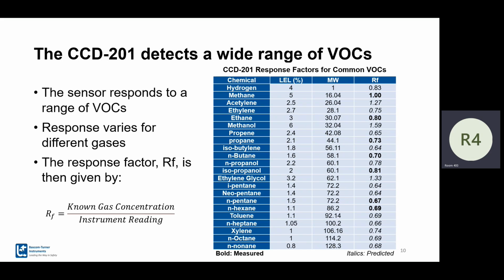Are those all the ones you currently have response factors for? Yes, because you just don't know which ones people run. There is a lot of engineering time to figure that out. Some of the gases are toxic, and we do not have the ability to measure toxic gases in our facility. So those are the things we have to figure out. But we can give a theoretical model, and we are pretty confident that it's within about 10% of that theoretical model. But if somebody wants to validate it, we need to do an experiment to figure out how to do an experimental validation of it.